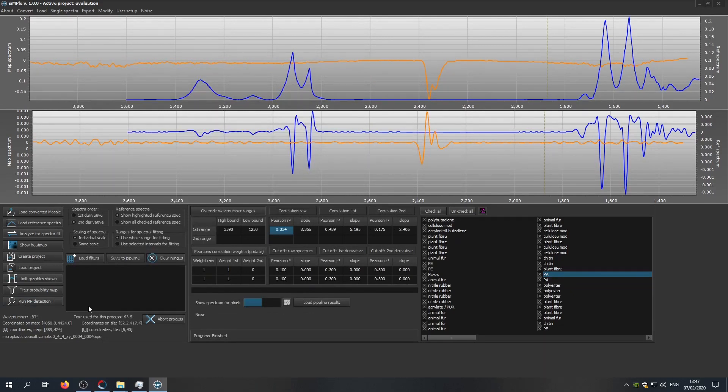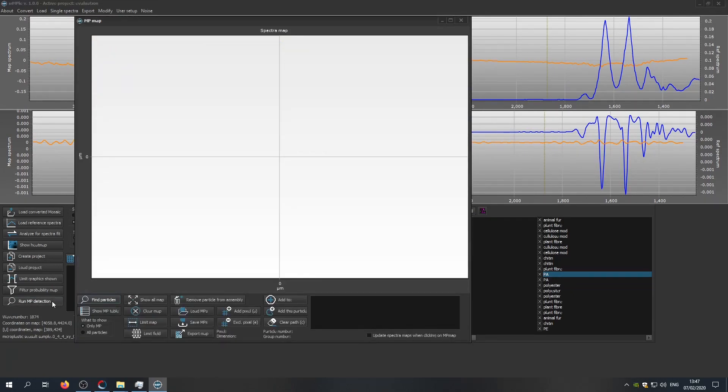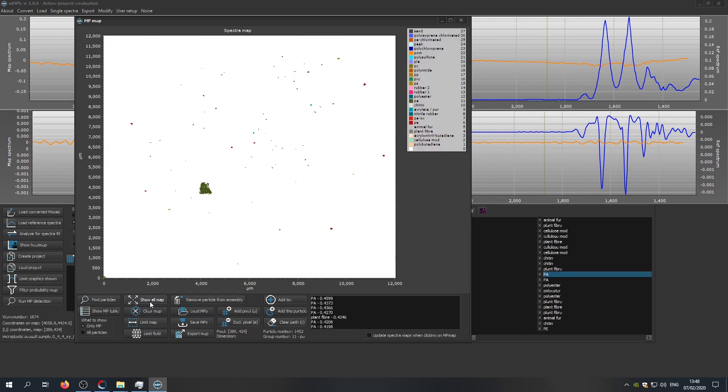To get to the results of the analysis, we click on run MP detection, find particles, and it will now, based on the correlation map, calculate the particle map. When the calculation is done, we can click on show all map and we will be given a spatial distribution and a color coding of the particles on the filter area.